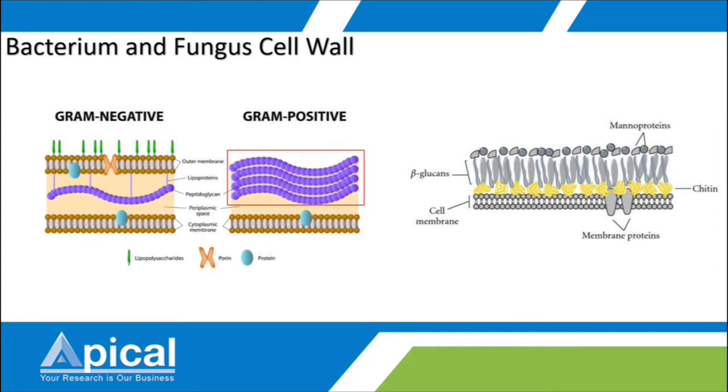The peptidoglycan is actually a long anionic polymer, so it needs to be broken down by hydrolysis with an enzyme called lysozyme. That's why for lysis of gram-positive bacteria, you may find an additional treatment step is needed with this lysozyme.